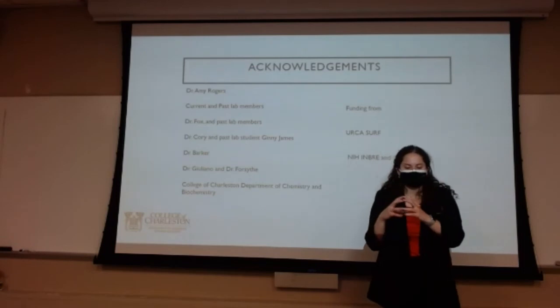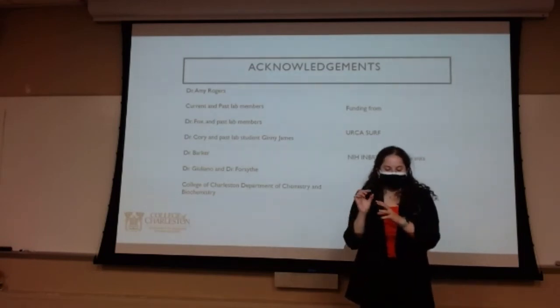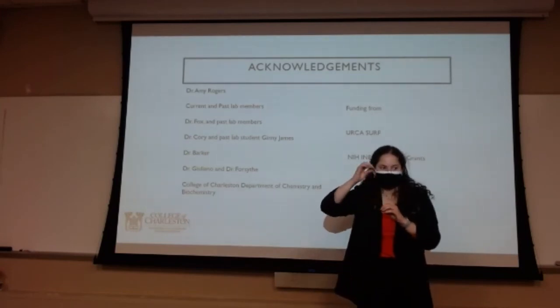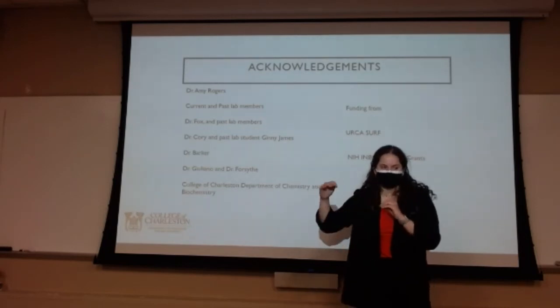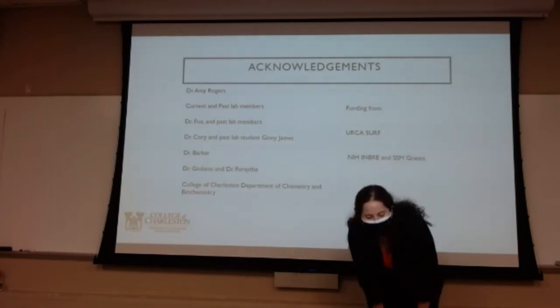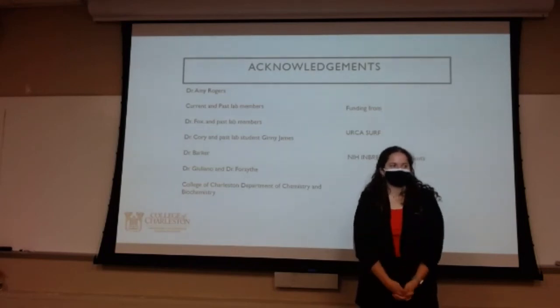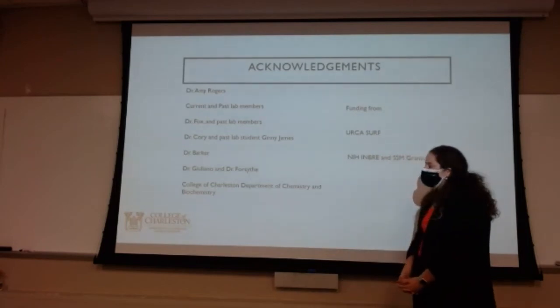Whenever you have a plasmid, it's like fun with science. I think it's just like engineering with science. So the plasmid is set up so that it adds a 6 histidine tag onto the end of it, so that you can make the nickel column viable for doing that type of separation. So you can get a cleaner purification in the end. The ULP1 is specifically engineered for that SUMO protein too. So yeah, I think it's commonly done across research for this type of thing, because it just helps with isolating.